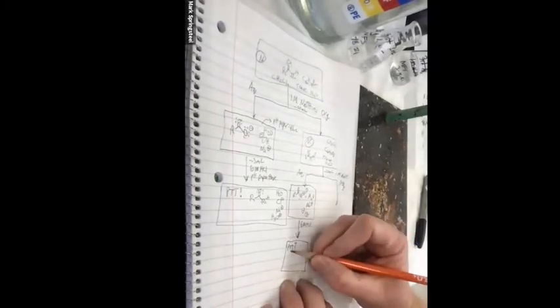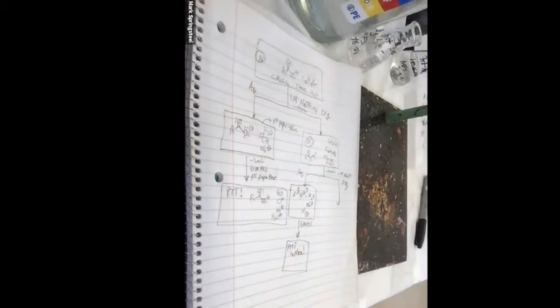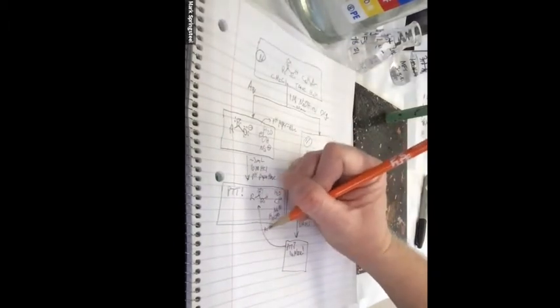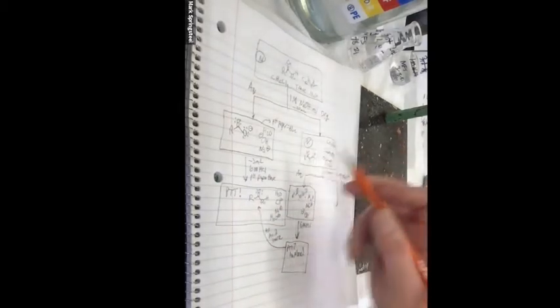Okay, so no precipitate. What does that mean? What does that tell us? Means you got all of, or at least the vast majority of the carboxylic acid out in the last reaction. Yeah, all the acid is here. So that means back here, I didn't have that.